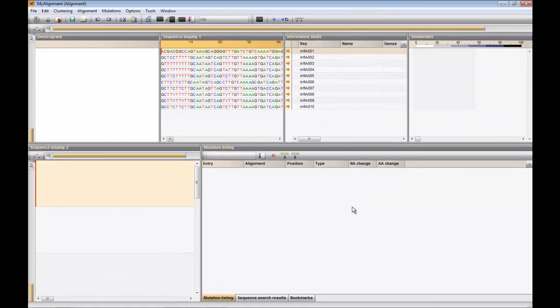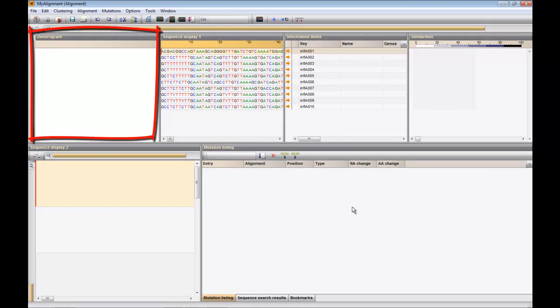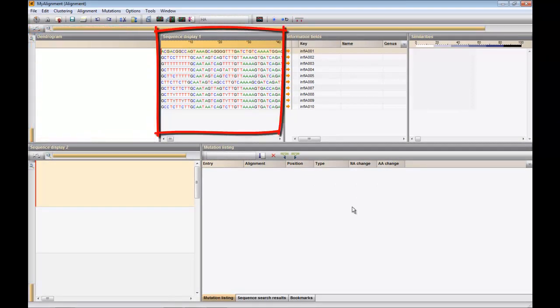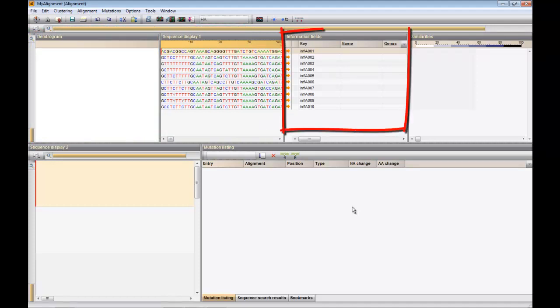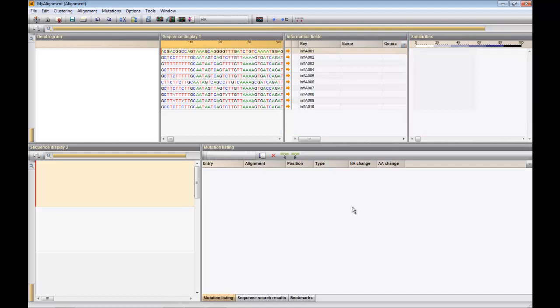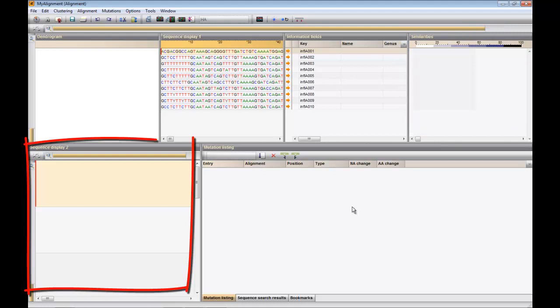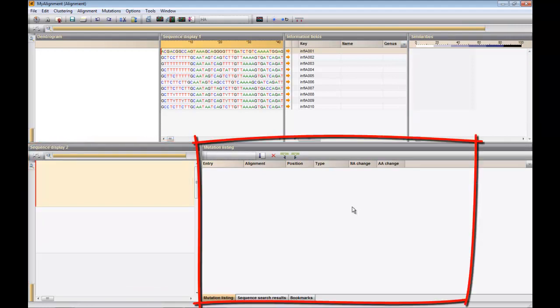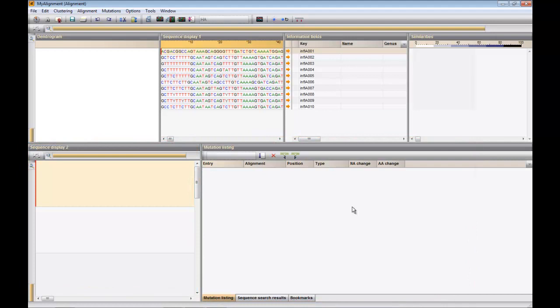The alignment window consists of six panels: a dendrogram panel, a first sequence display panel, a panel that shows the information fields of the selected entries, and a panel for the similarity matrix. Below, we have a second display panel and a last panel to view the results of the sequence searches and mutation searches.